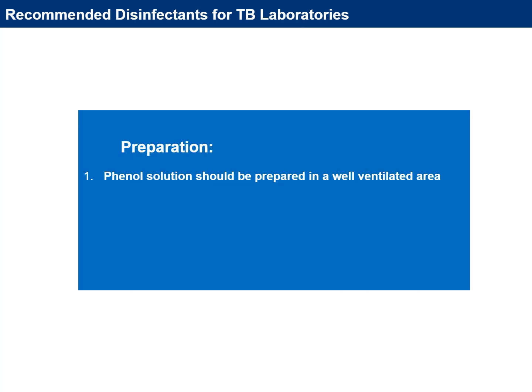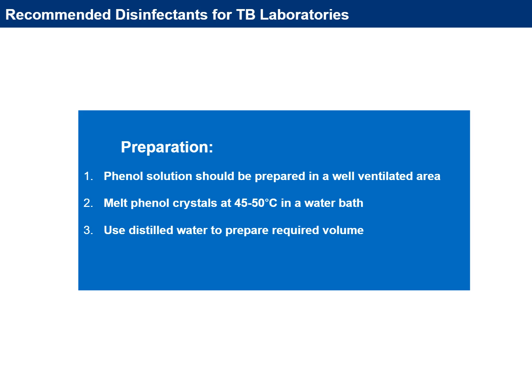Phenol solution should be prepared in a well-ventilated area. Melt phenol crystals at 45 to 50 degrees Celsius in a water bath. Use distilled water to prepare the required volume.